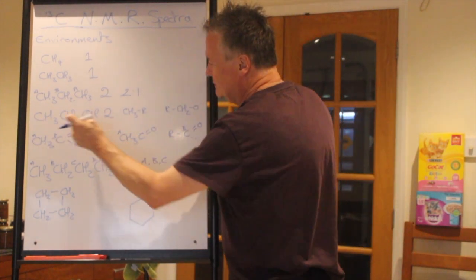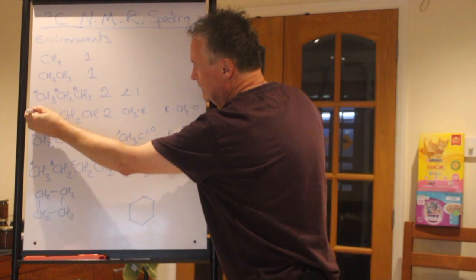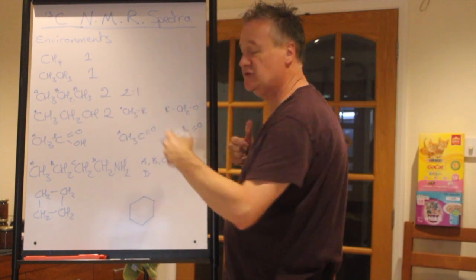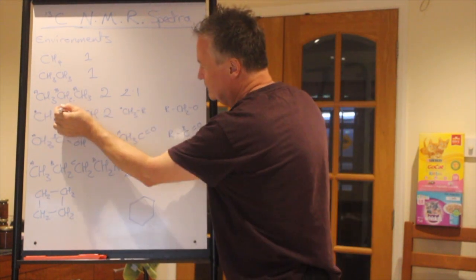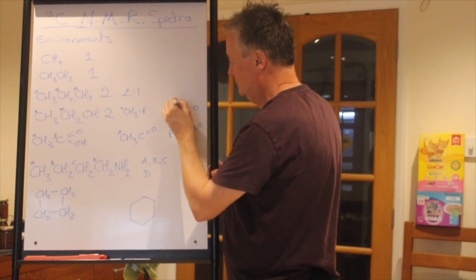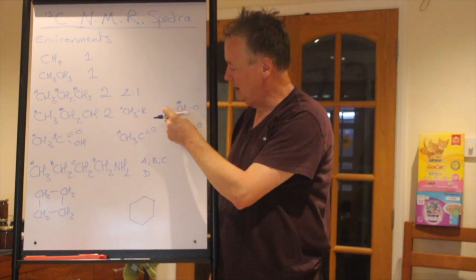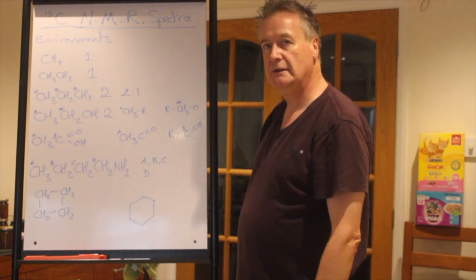So when you look at this carbon here with a dot on it, it is attached to some other R group with carbons. This one, which I put an asterisk on, has an R group which is represented in CH3, and it's attached by a single bond to an oxygen on the other side.